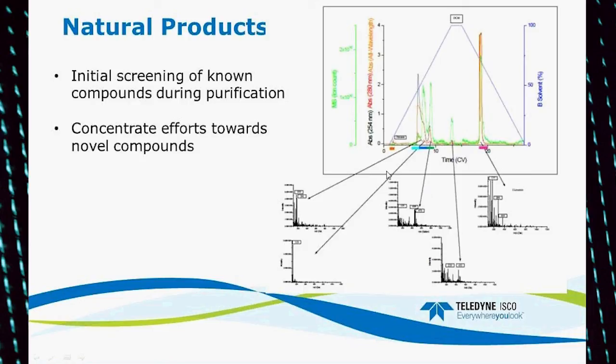So what they would be looking for would be a novel peak that has an unusual molecular ion that is not a common product. So that might be what they would be isolating to look at.